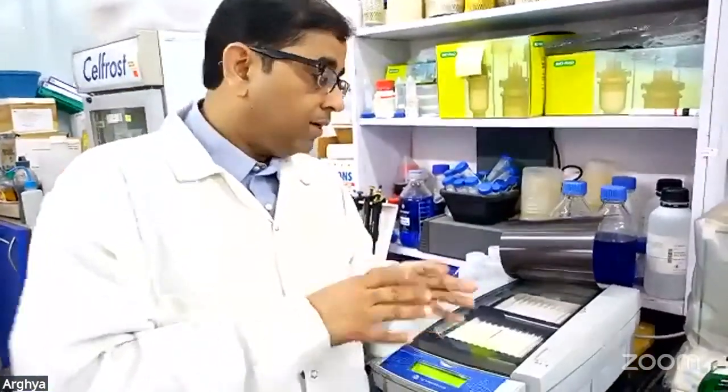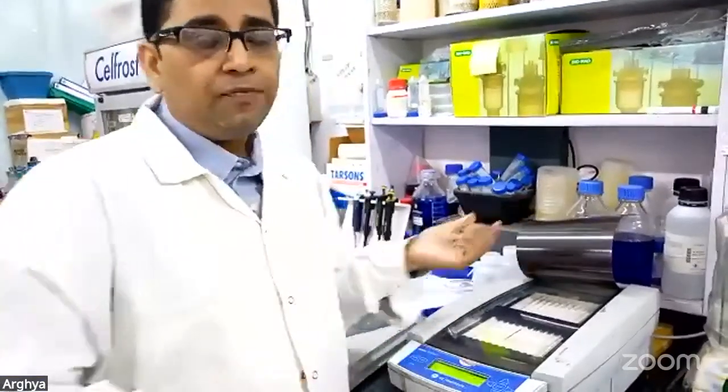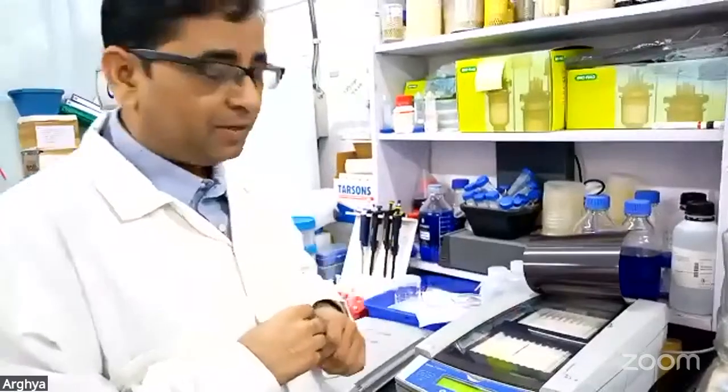For the small strip, we want to achieve 75,000 volt hours, for example. For the large strip, we want to achieve maybe 125,000 volt hours, and we give the instrument as many hours as needed at that voltage to achieve the volt hours. So depending on sample movement, sometimes this IEF can finish in 20 hours, sometimes it can take 24 hours. But you want to achieve a specific volt hour depending on your objective and the type of IPG strip.